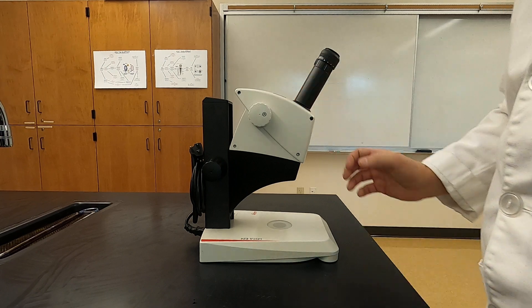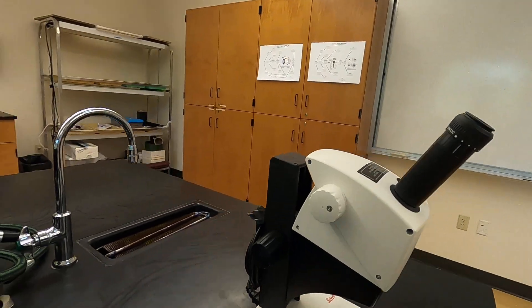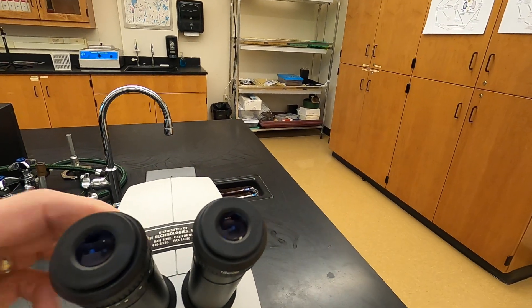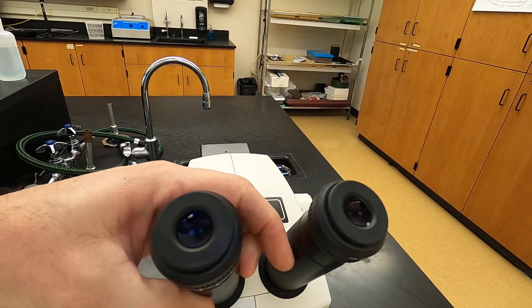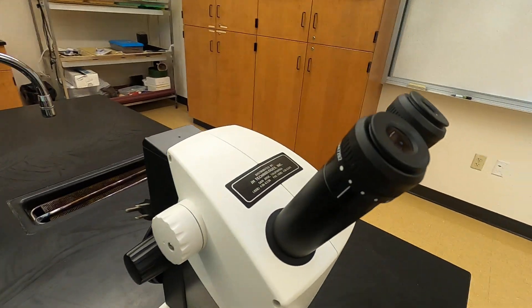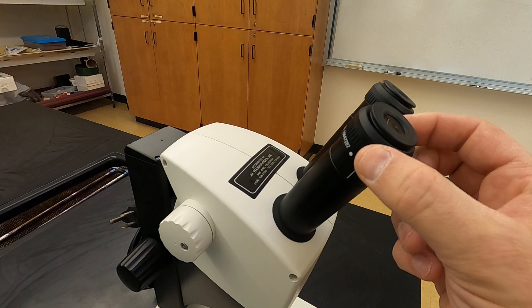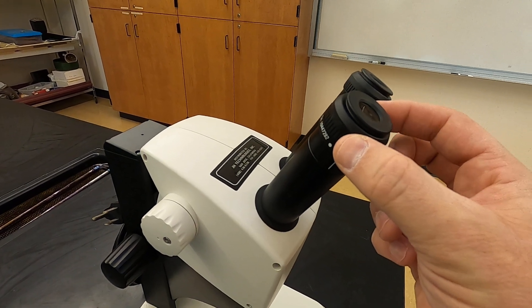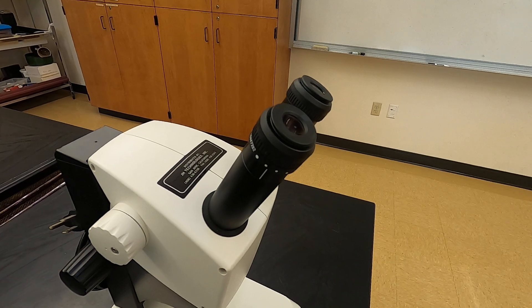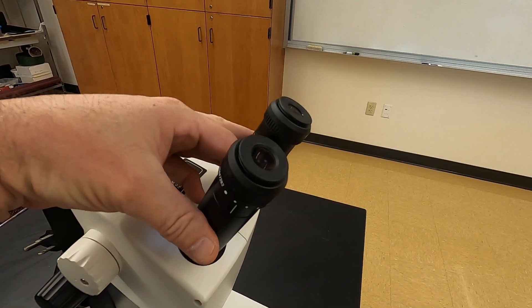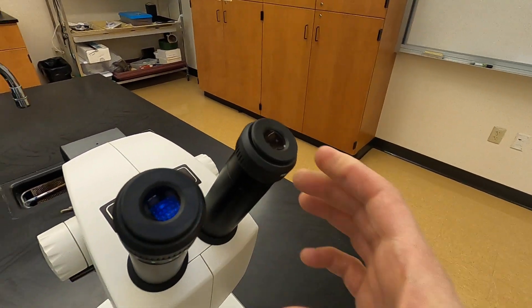Now for this, let me move over and show you here. We can actually adjust the ocular lenses like we did before for the interocular distance, and these microscopes do have a diopter adjustment as well that we can use to adjust for differences in vision between the left and the right eye. So you will be able to adjust both of those.